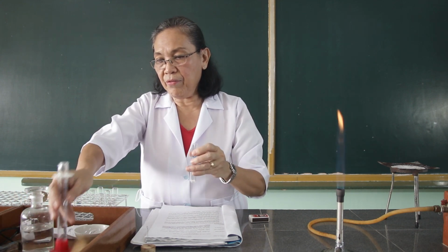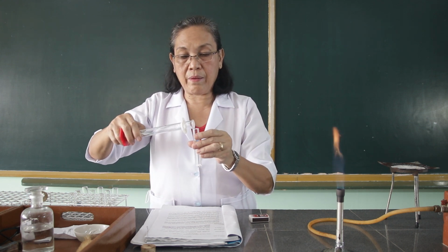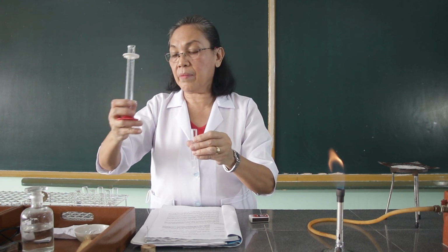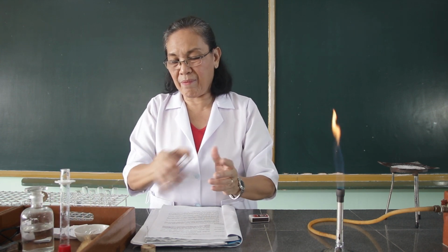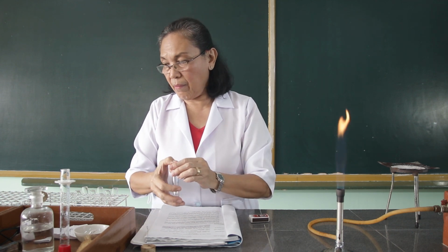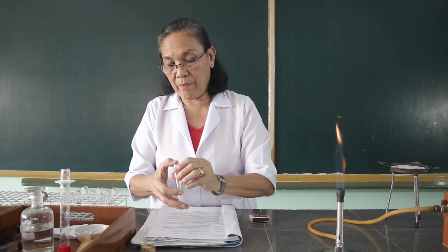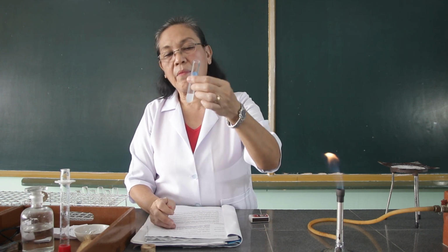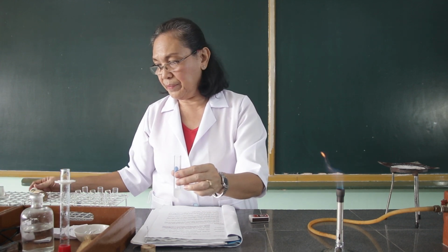And let's add 1 ml of water to this. And add 1 ml of the hydrochloric acid solution.